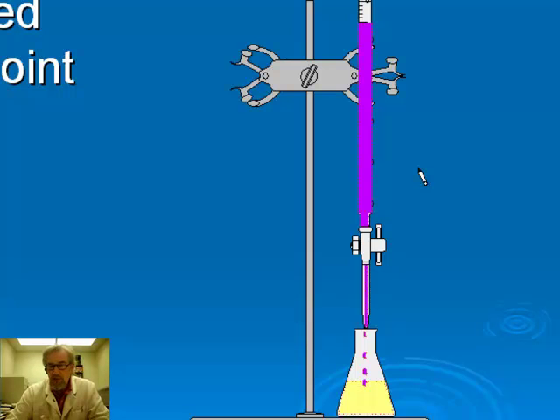In the picture here, you can see the valve is open, the tip is full, and now drops of the purple solution are dropping from the burette into a flask. As this continues, you watch for a visual cue that indicates the reaction is completed.